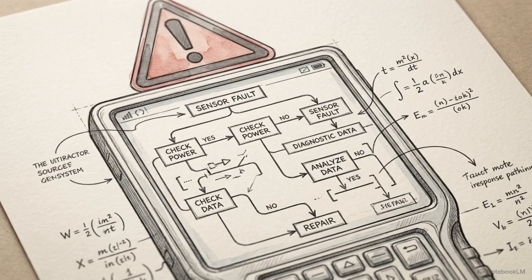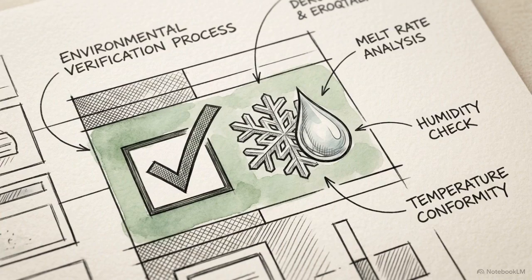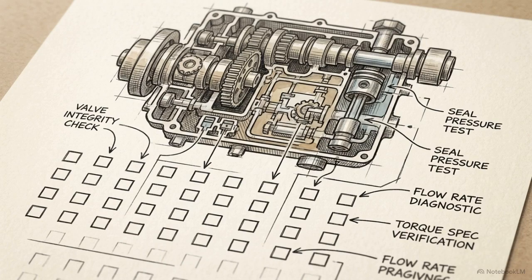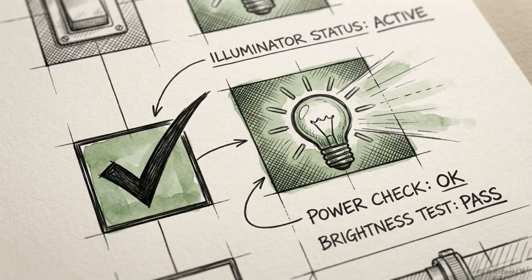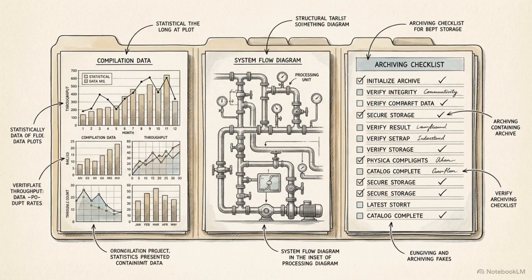The moment your 3 sigma action limit is breached, you begin the root cause analysis workflow. This checklist models your first phase of investigation, the external environment. You check for recent spring thaws that wash organics into the feed water, and you review local data for aging municipal water pipe breaks that introduce organic slugs. Next, you move down the checklist to internal facility factors. You verify the condition of the reverse osmosis membranes for fouling, and you log the exact operational runtime of your UV lamps.